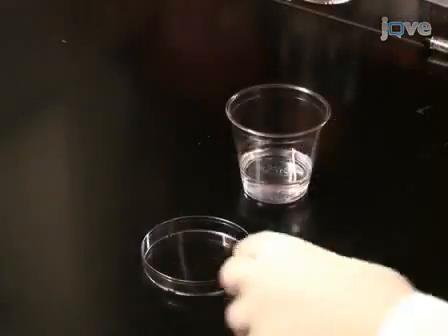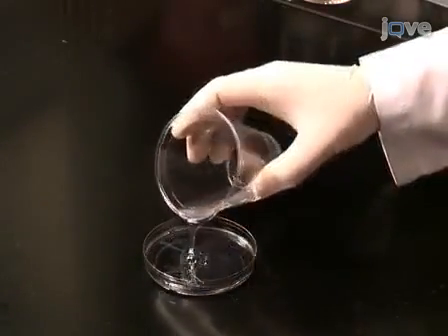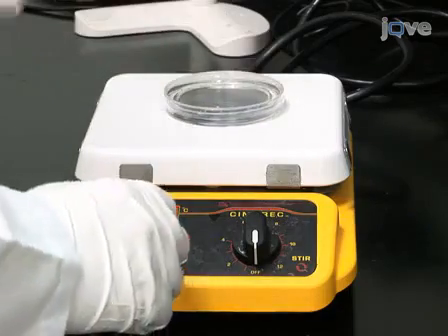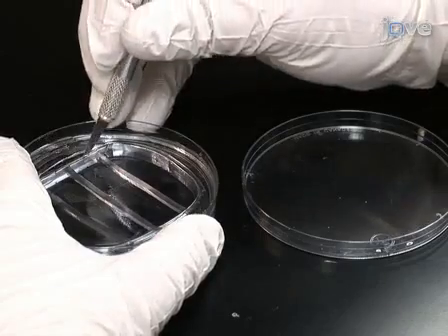When the PDMS mixture is ready, place the SU8 master in a petri dish and carefully pour the mixture on top of the SU8 master to the desired thickness. Heat the petri dish containing the PDMS and the SU8 master mold at 80 degrees Celsius for 2 hours to cure the PDMS.